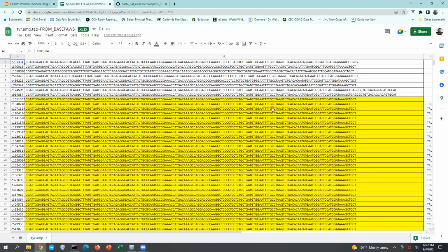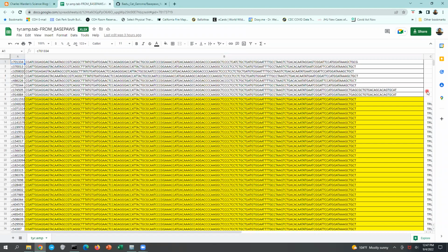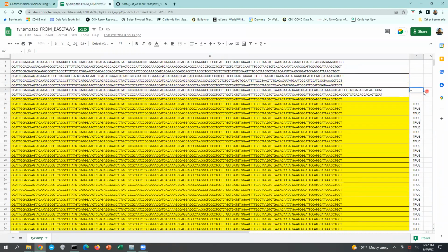So what I did is I took a text file, I imported it to Excel, and I sorted in alphabetical order, which is for this second column or column B. So sequences that are identical to each other are now next to each other. And I use a formula in Excel, which I can write here, which checks 2 cells to see if they have the same content. So in this case, cell B6 has a sequence that's a different length than cell B7, so therefore they should not be the same. It should say false. And indeed, that is what it says. You can drag down the formula, and it just so happens these 2 sequences are identical, and these sequences, which are different lengths, must also not be identical, and it says false.